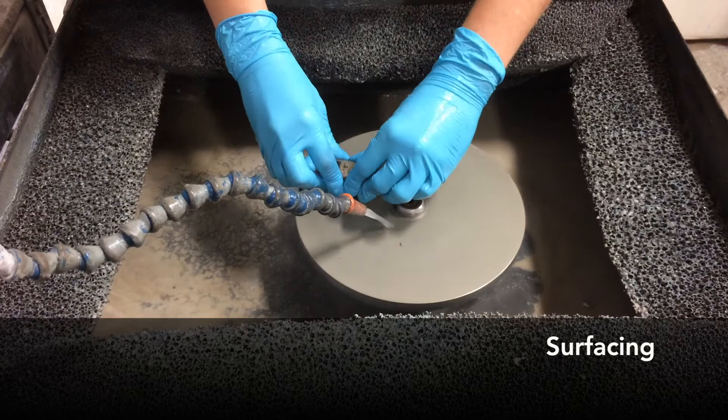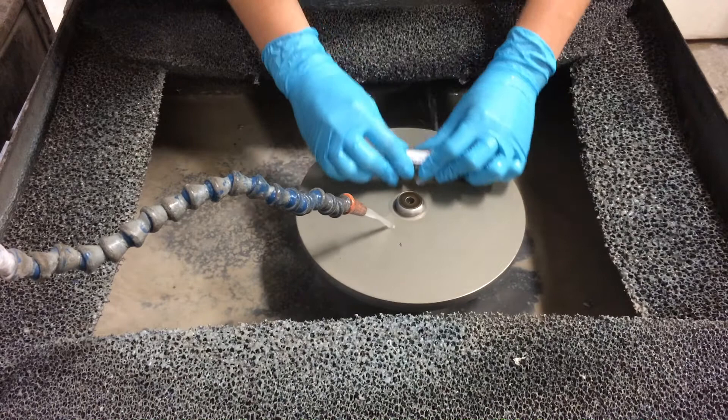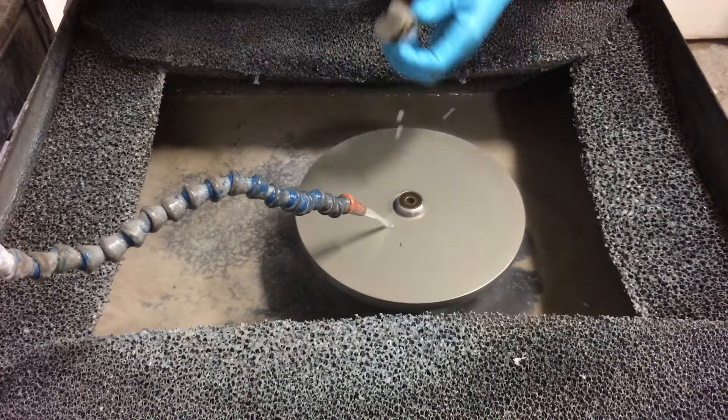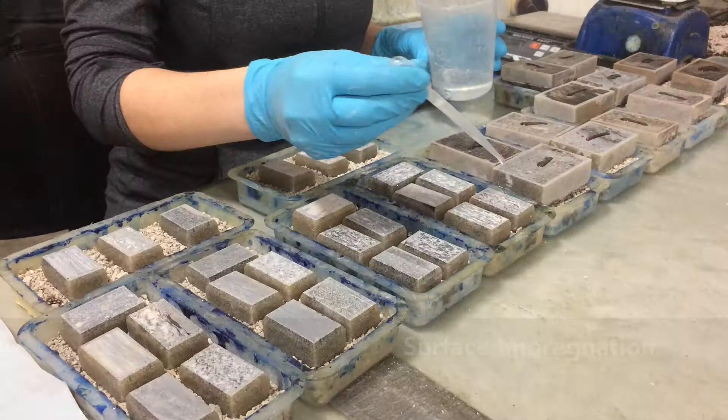The billet comes out of embedding with some pretty sharp edges, so we dull those down in order to handle them comfortably. Surfacing involves preparing the thin section target face on increasingly refined laps and wheels. First, the sample is exposed on a coarse grit diamond lap, then the exposed face is flattened and refined on a medium grit diamond lap.